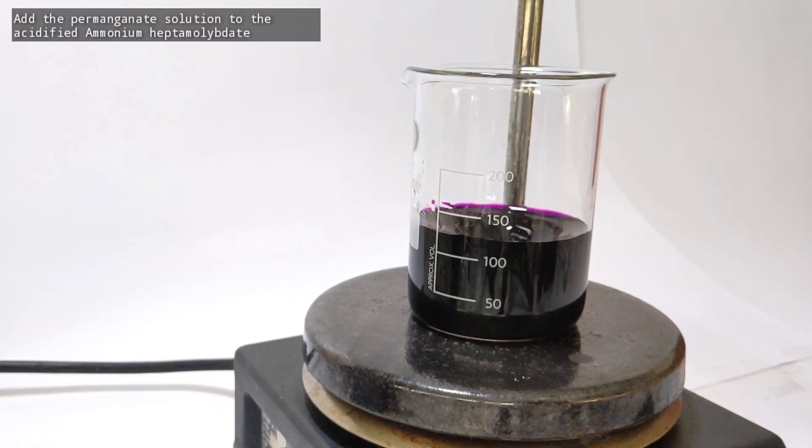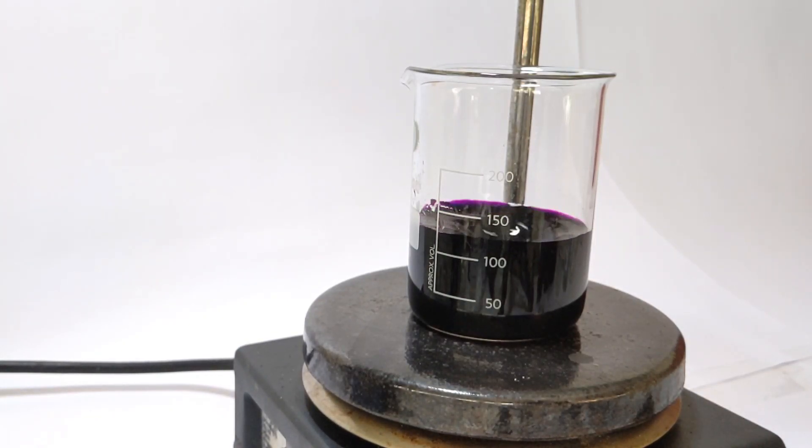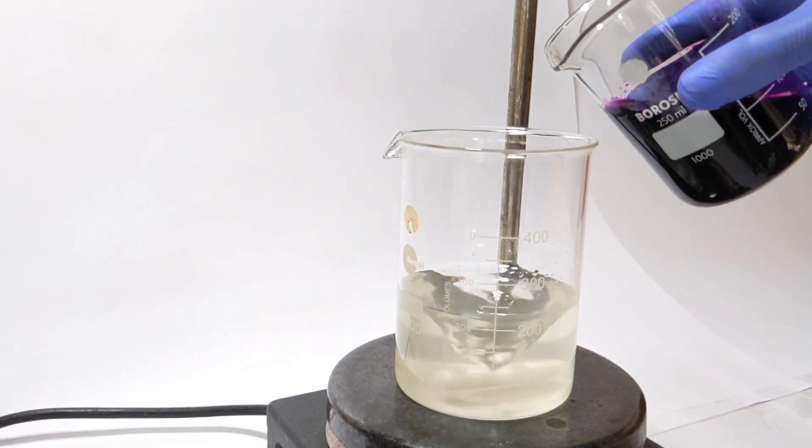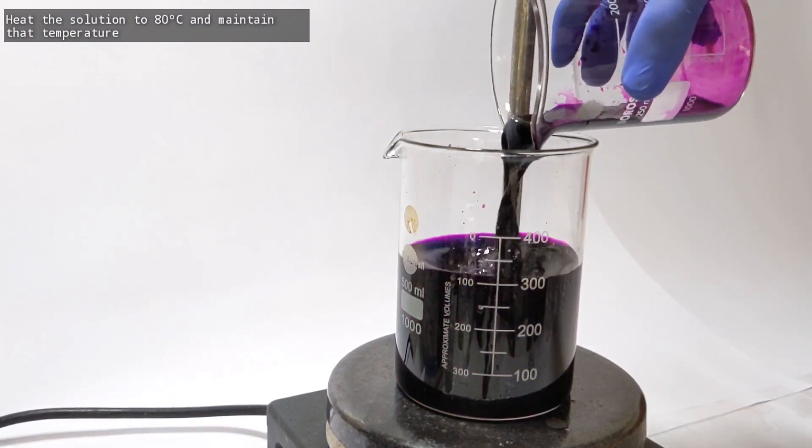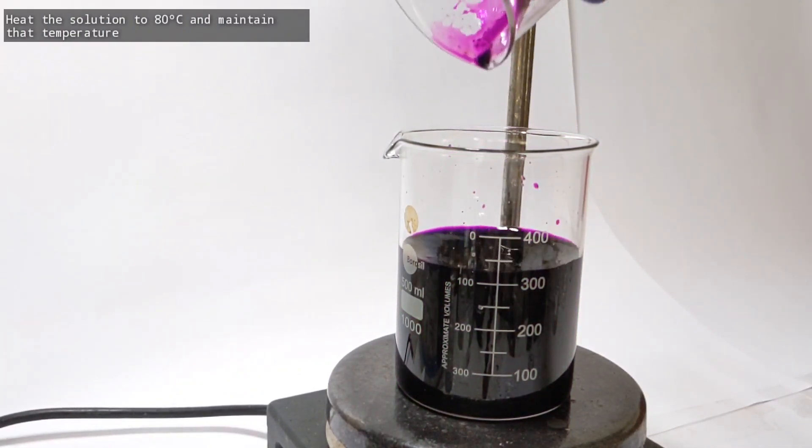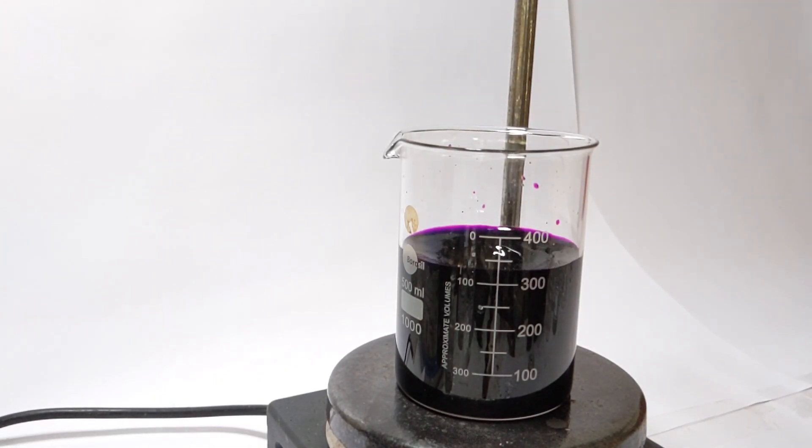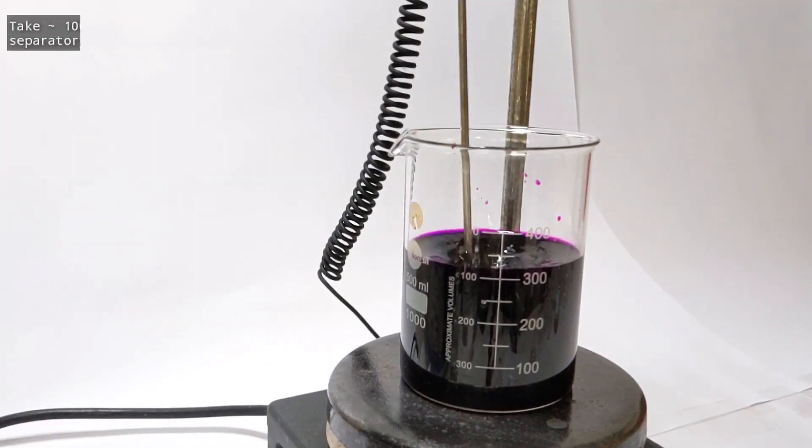Now add the potassium permanganate solution to the pH adjusted solution of ammonium heptamolybdate. You can add everything at once. Now the temperature was raised to 80 degrees Celsius and maintained at that temperature.